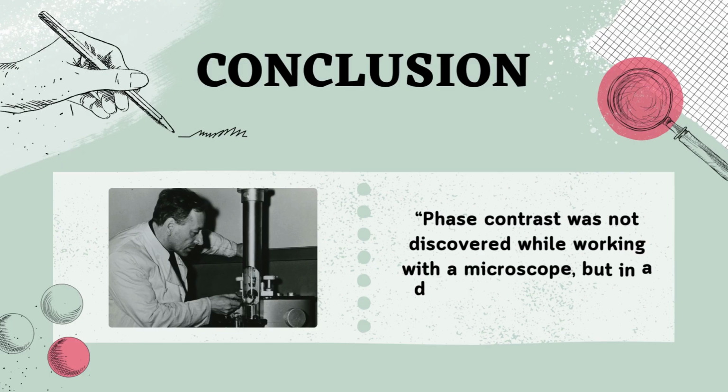Phase contrast was not discovered while working with a microscope, but in a different part of optics. I interpret this sentence as a reminder to always think outside the box and not focus solely on one approach.